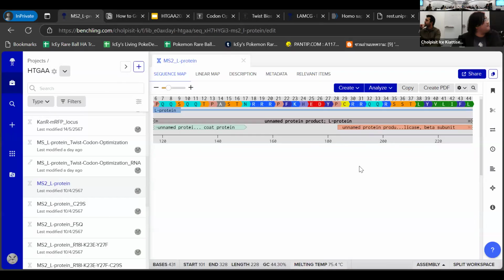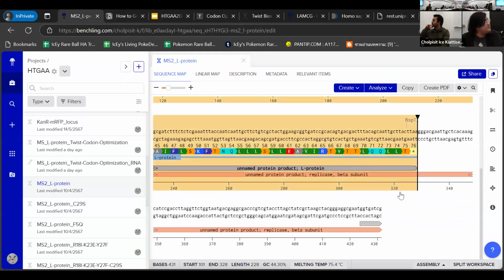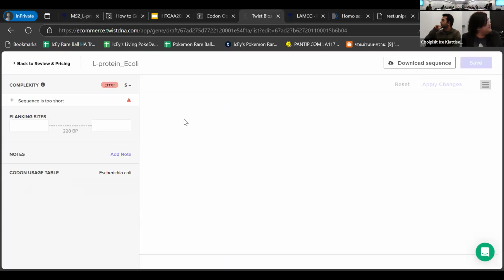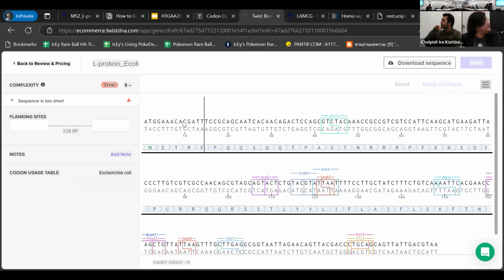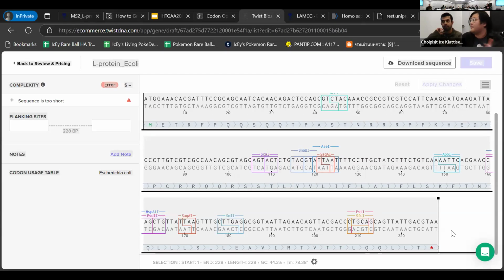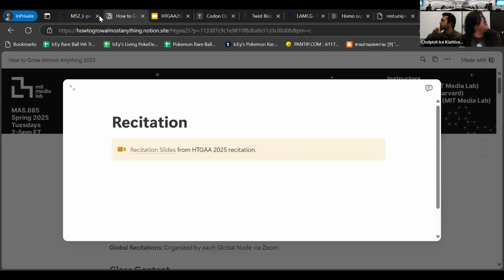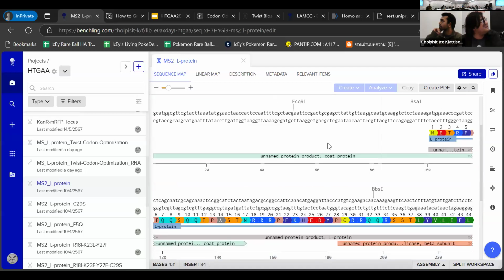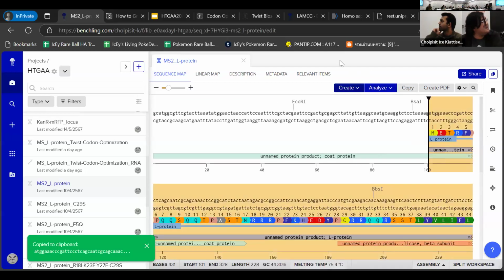And let's say you have the DNA of interest already, right here. You want it to be longer, so you can put other DNA on top of it, and then you can take that to do the PCR later on. So for example, if you want to do the trick, I want to make it synthesizable, I may just add another DNA here.